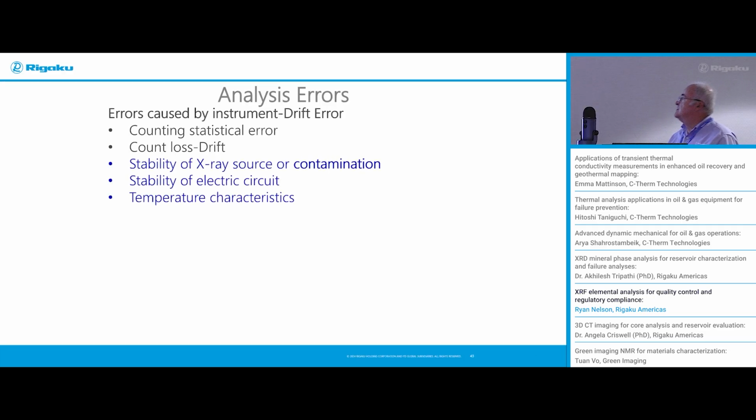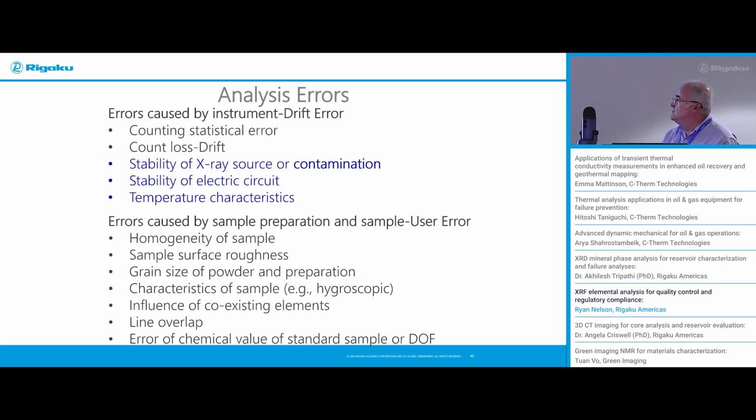Statistics. So most of the error, of course, is not the stability. It's definitely going to be count loss and really sample setup. So errors, this is typically the contribution to errors.